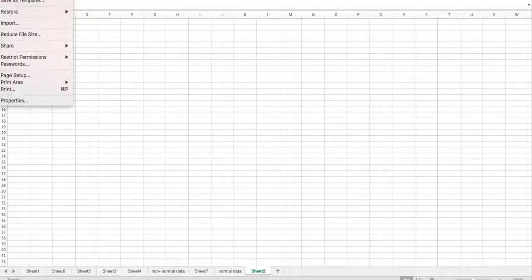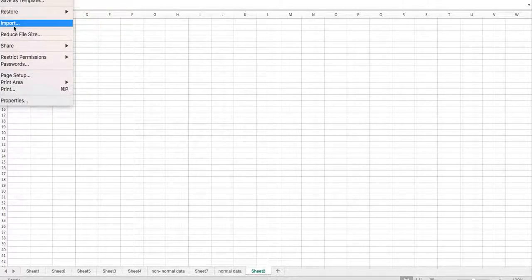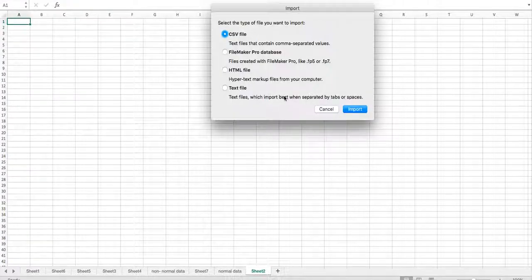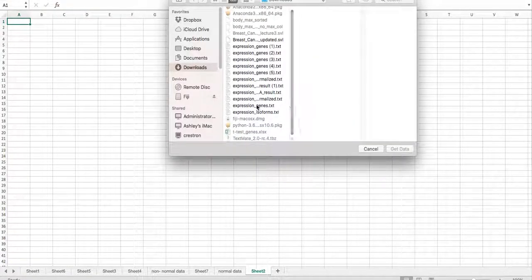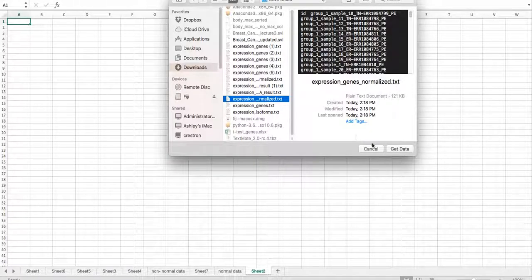Go up here to File, then Import, and select the normalized data.